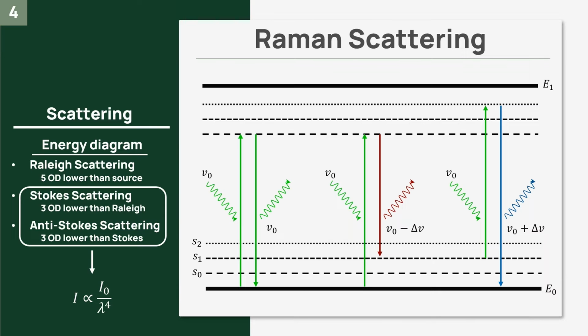Some energy comes in from a photon of a laser, and it then drops to a lower energy state, but not as low as before. Some of the energy excites a mode of vibration in the molecule, and that loss of energy translates into the photon being redshifted, basically having a longer wavelength when it leaves the molecule.